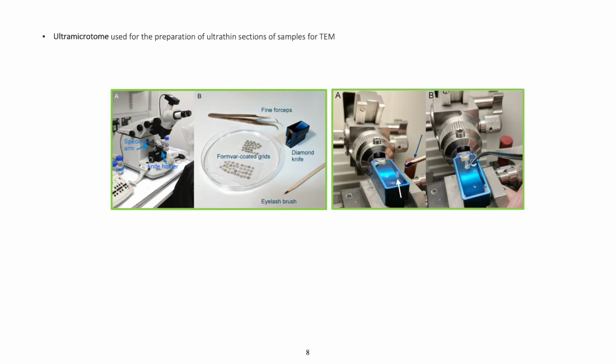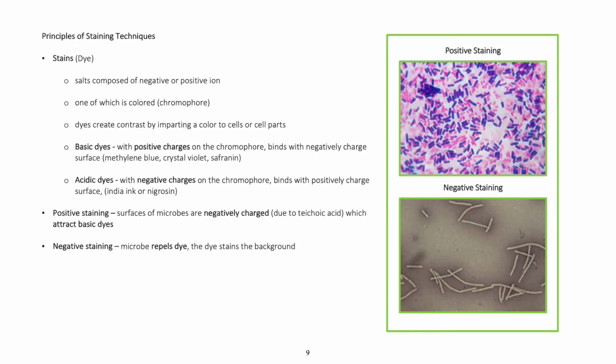Ultramicrotome used for the preparation of ultra-thin sections of samples for TEM. Principles of staining techniques. Stains or dyes are salts composed of negative or positive ions, one of which is colored, the chromophore. Dyes create contrast by imparting a color to cells or cell parts.